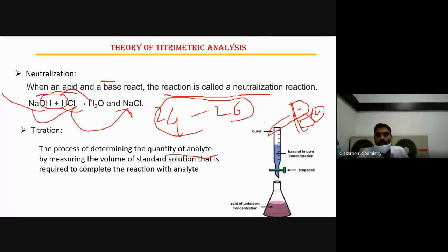Again, see the same example. In the burette, there is a solution of known concentration, and in the second slide, we call it a titrant. It is titrant. And whatever may be the volume, for chemical kinetics you take different types of solution in 2 ml, 3 ml, 5 ml, add ice to it, and finally titrate with the burette.